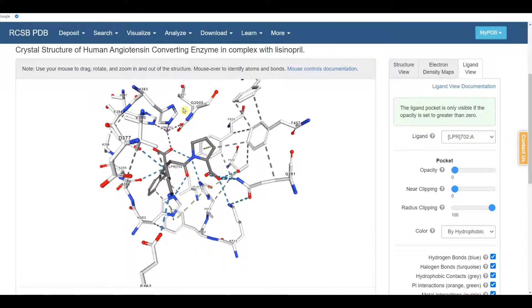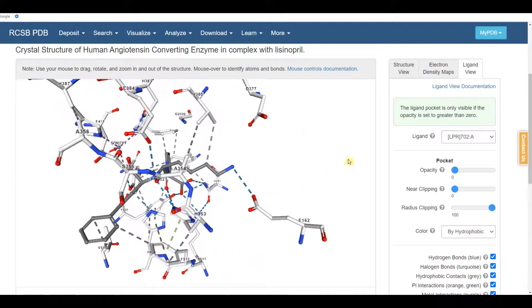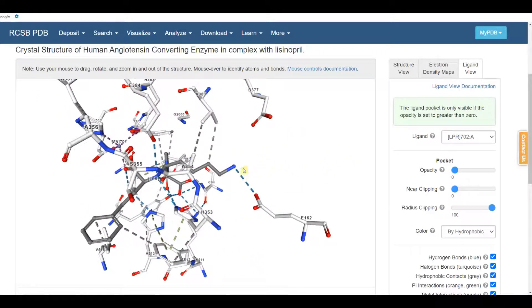And I admit, it takes some practice to get used to looking at these structures. But the program is showing us every possible interaction. If we hover over some of these lines, here's a nice one. This is a line between lisinopril and one of the amino acid residues. Just hover over that. That is a hydrogen bond.